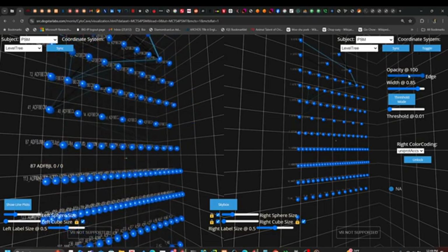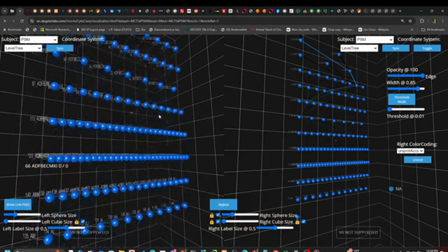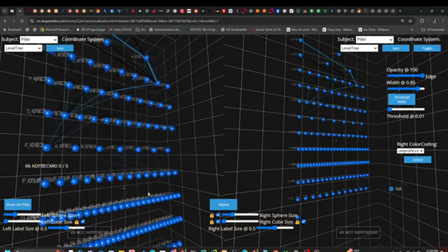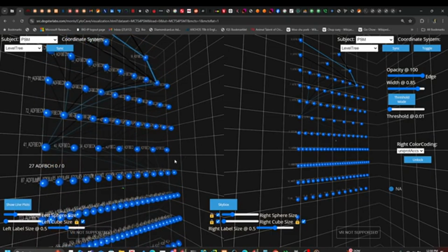And you can adjust the weight of the edges with this slider, so you can see some of these edges show up. The edge weights denote the relative confidence of the extension from the chain, or the complex assembly path, denoted with a given sphere to the various possibilities.